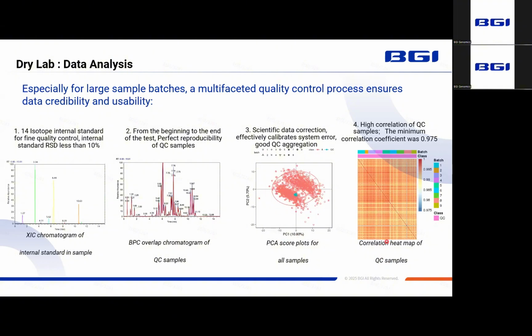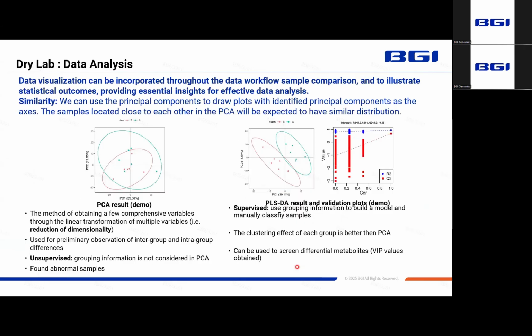map of QC samples. You may not be familiar with this map, which is exactly what I am coming to answer. How could we work with this huge amount of complex data? Data visualization can be integrated at many stages of the data processing and analysis workflow. It may be used for exploratory purposes to gain an understanding of the data's underlying structure and patterns. It may help visually compare samples and identify outliers.